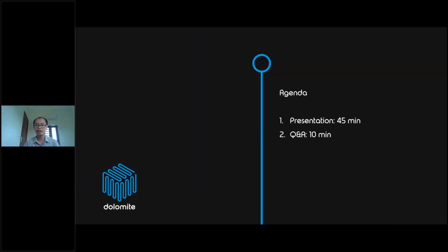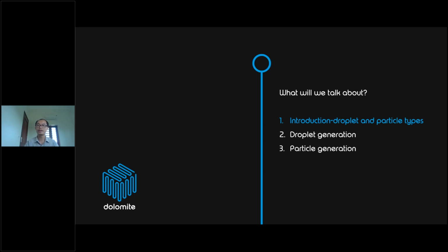So the agenda today will include a presentation and a Q&A section. During my presentation, if you have any question, feel free to write it down in the question box, and we will try to deliver the answers to all of you in the Q&A section. The content of the presentation today will include an introduction about droplet and particle types, and after that we move to droplet and particle generation.